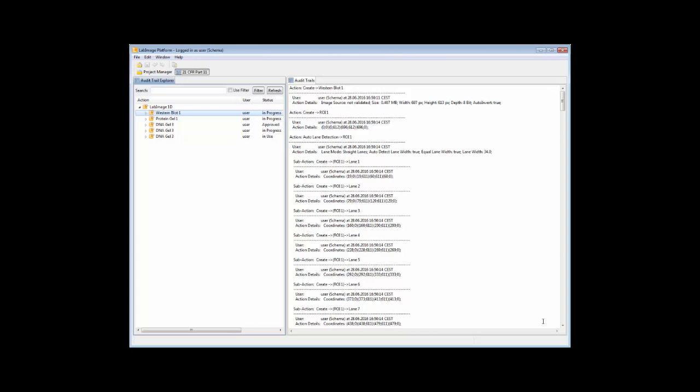Each step within the workflow to analyze the gel results in a log entry using user name, date and the action itself, so a detailed log called audit trail is generated and securely saved.